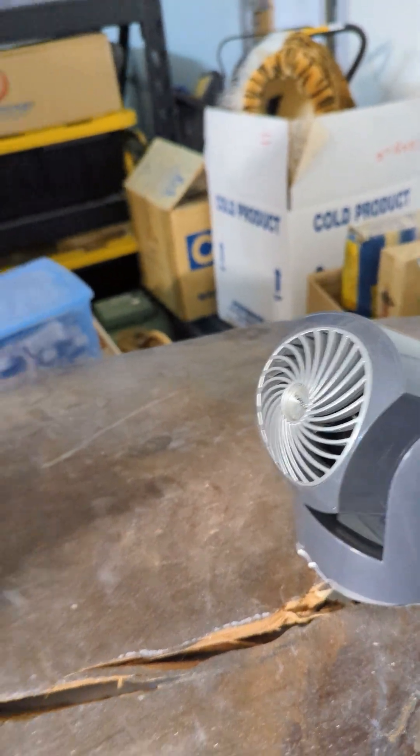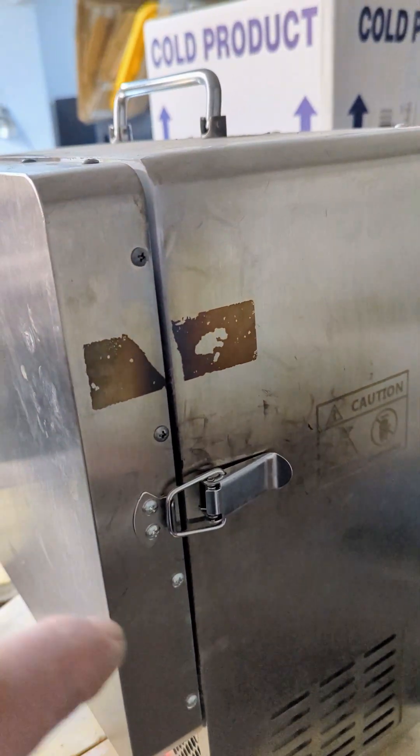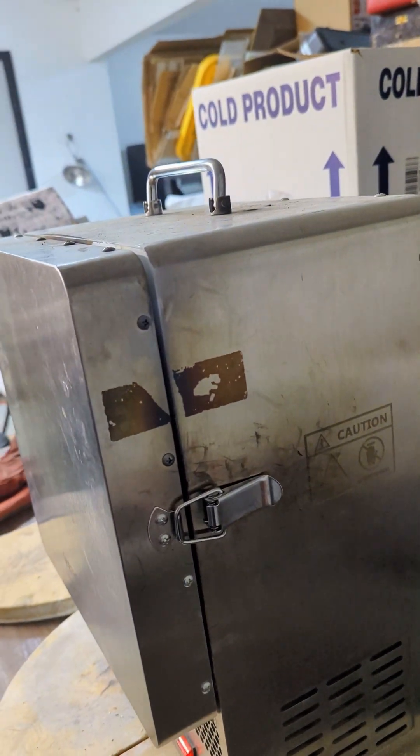I'm going to try something different during this cupellation process. Once the kiln is at temperature, I'm going to turn on the fan, crack open the kiln door just a little bit, and have air blow over the edge — hopefully introducing more oxygen into the chamber.